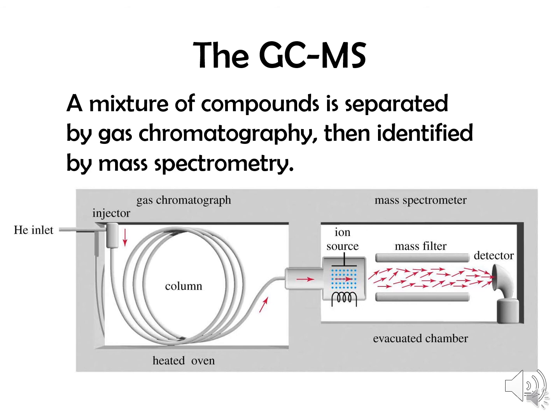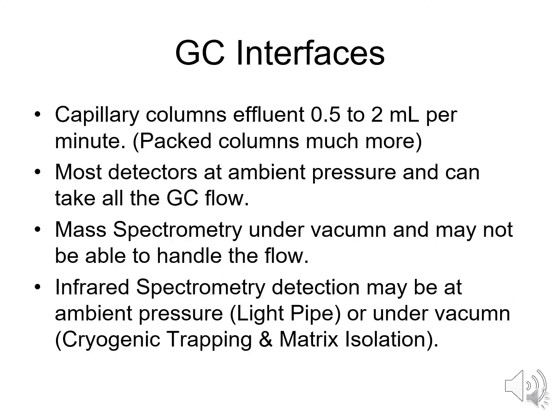And depending on how your mass spectrometer is tuned, that's going to determine what your mass spectra look like. So mass spectra are not absolute. Mass spectra depend upon your particular mass spectrometer, how it's going to look. And that's why everyone tries to tune according to certain conditions so that we all get mass spectra that agree. So it's kind of artificial in a way.